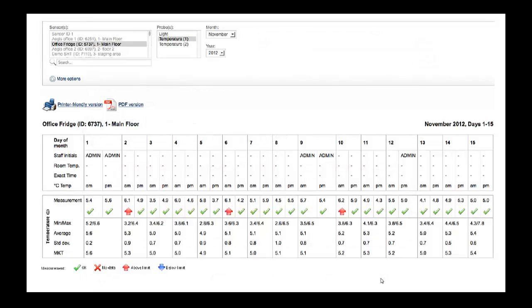This report is great for those units that need users' acknowledgement for any given agency, particularly the CDC or Joint Commissions. Our system allows users to sign off on temperature points pertaining to their units. You're able to monitor or sign off on all units at one time from one location.